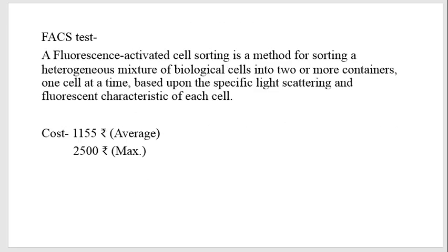So what I was talking about, a machinized test, is what we call a FACS test. This is basically a fluorescence activated method where they sort the cells and then count. The sorting is done so that most of the fluorescence tags go to the WBCs, to the nucleus, and RBCs are already outnumbering the entire solution.